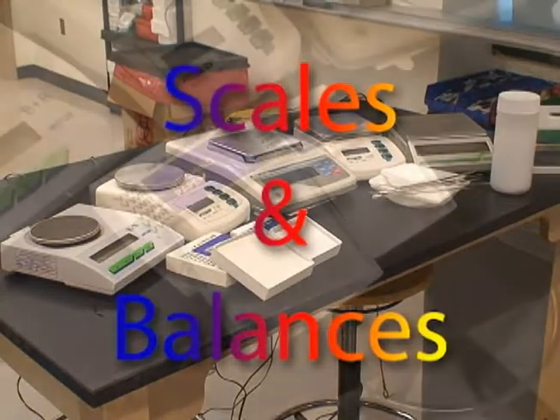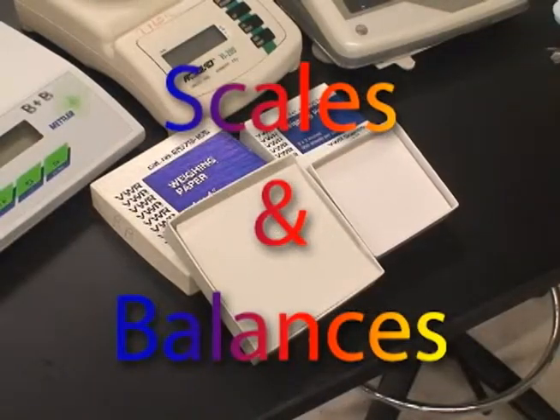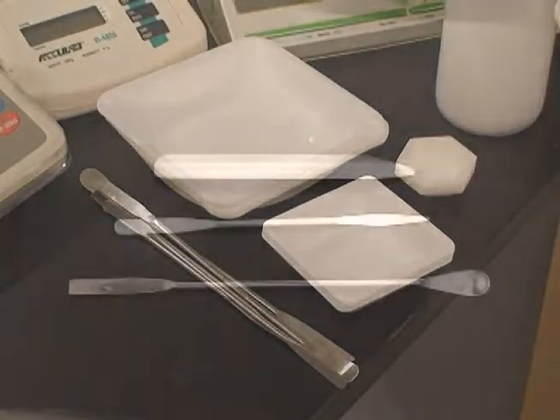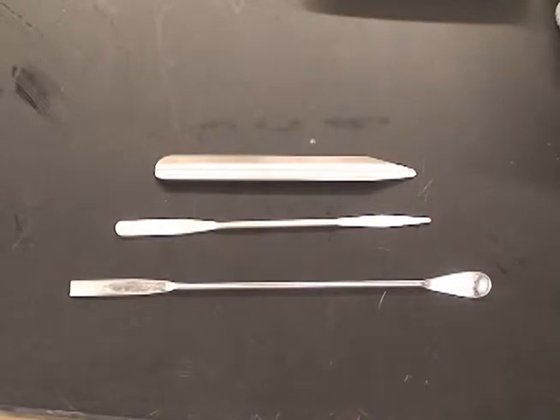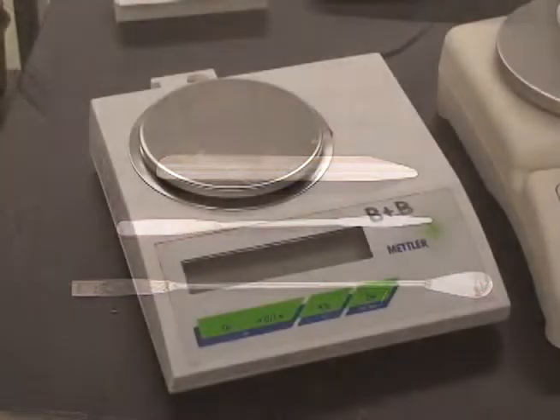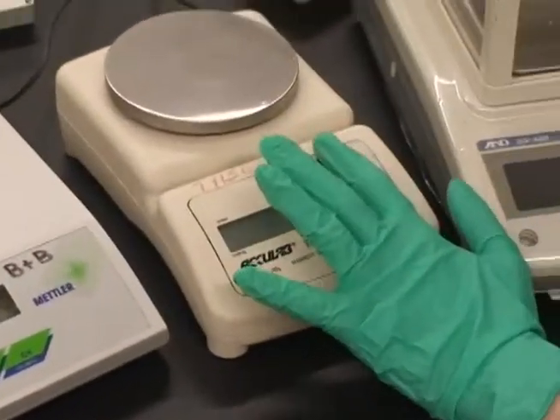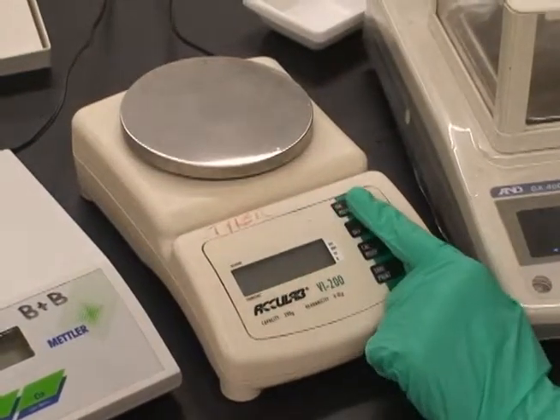When using a balance, make sure that it is secure on the table, it is plugged in, and that you have any measuring materials you may need. Measuring tools should either include weighing paper or a weighing tray, and should also include a spatula of some kind. Pouring a substance is not a good way to get it into the balance correctly.